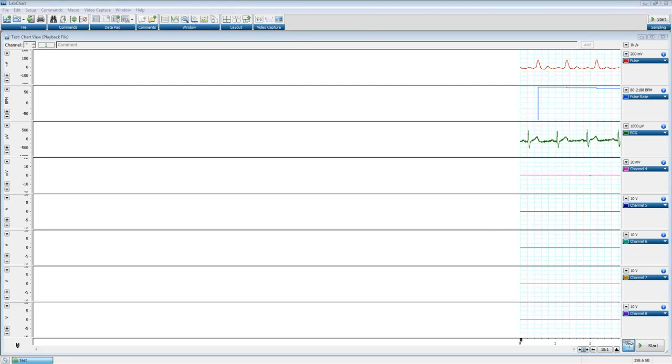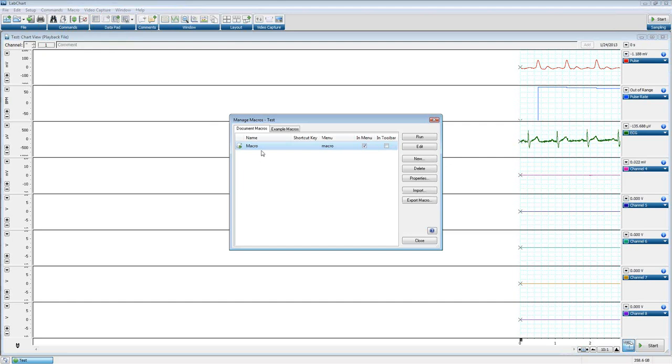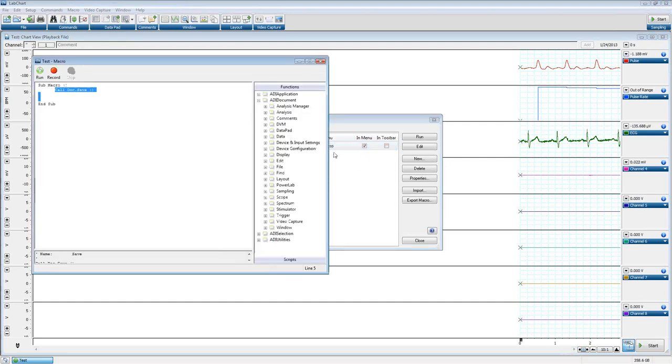So the next question we have here is, is there a webinar about simple and event scripts for PV loops? Not specifically, but if you have questions about writing macros involving PV loops, you can definitely just ask us, and we can get you started, head in the right direction anyway. You can look through the commands here, and you can see the options that are available if you're interested in looking at that. You can see throughout the document we don't really have options for the modules there.